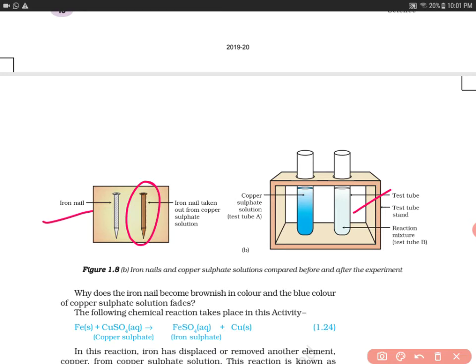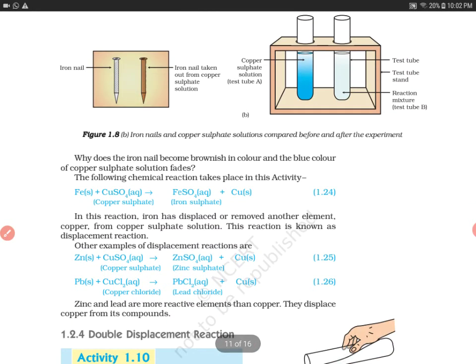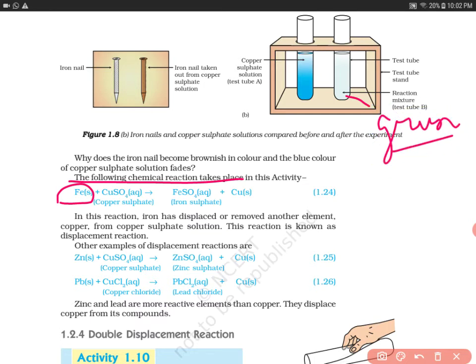The copper sulfate solution in test tube B has faded in color. This is because a chemical reaction has occurred. When iron is added to copper sulfate solution, the product formed is ferrous sulfate, whose color is green. Ferrous sulfate is called green vitriol, while copper sulfate is called blue vitriol.